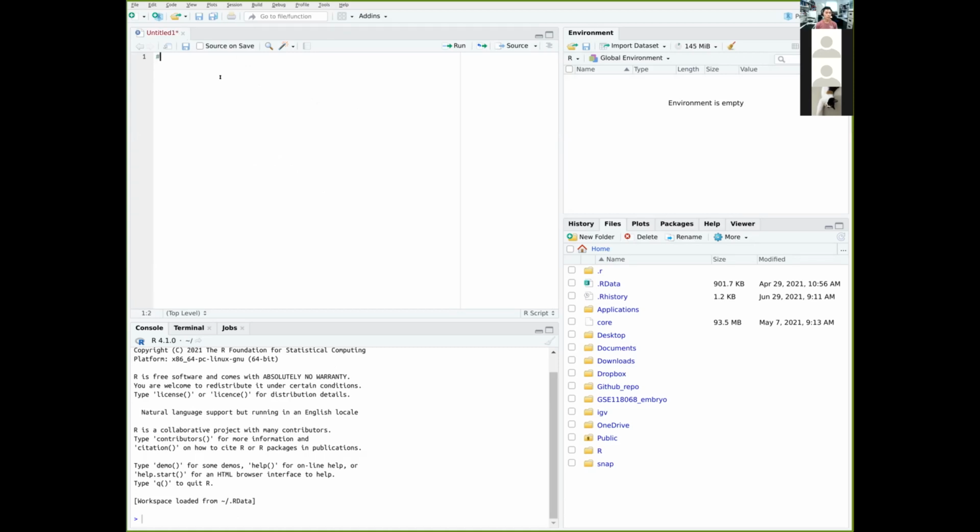Okay, cool. So we're going to start with loading our dependencies. This hash key, or this comment, is a character that tells our script that this is a comment line, and not to execute this line in our console. So you can actually comment out as much as you want within this R script and you will not perform any execution. So we're going to load 2 libraries.